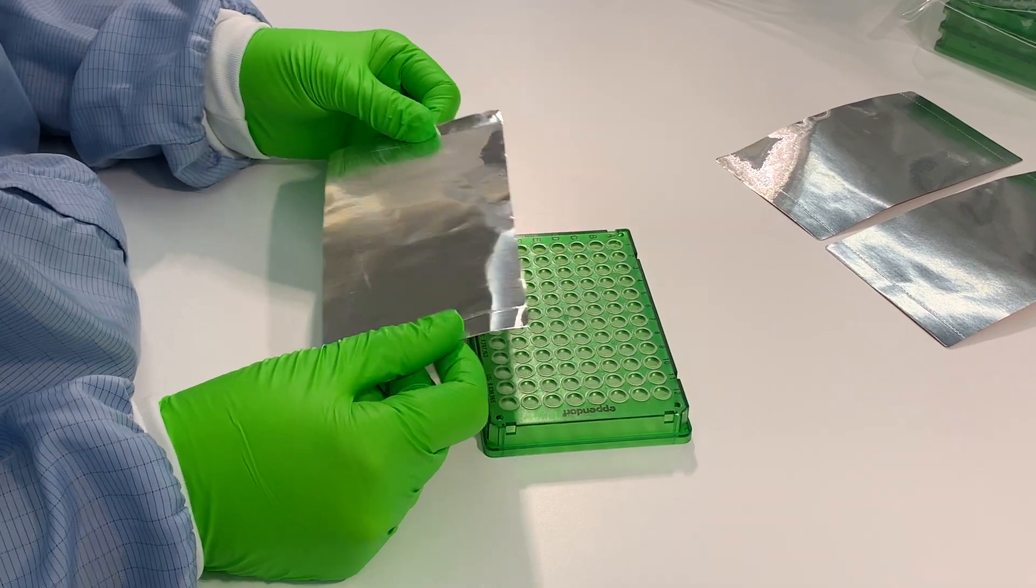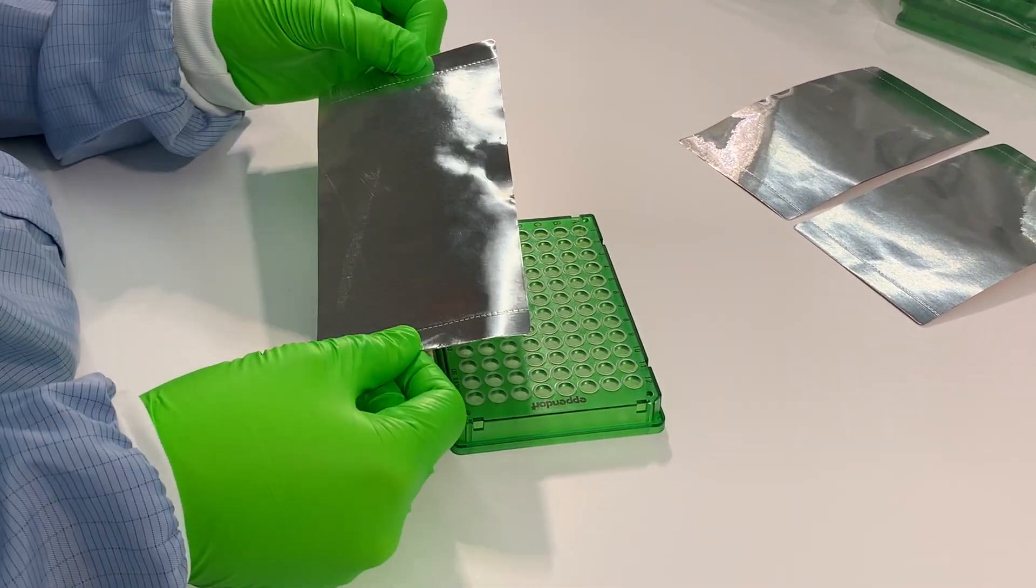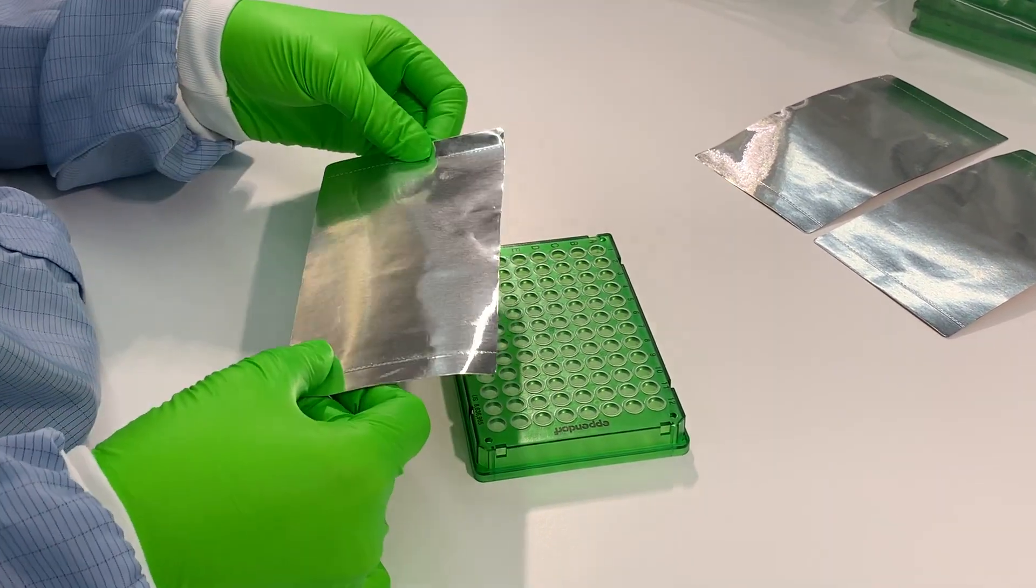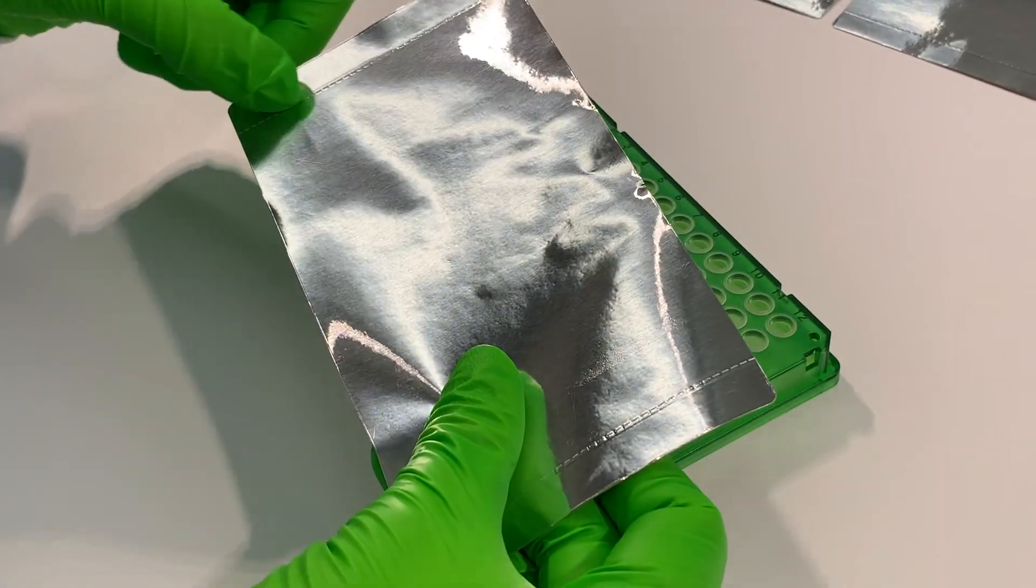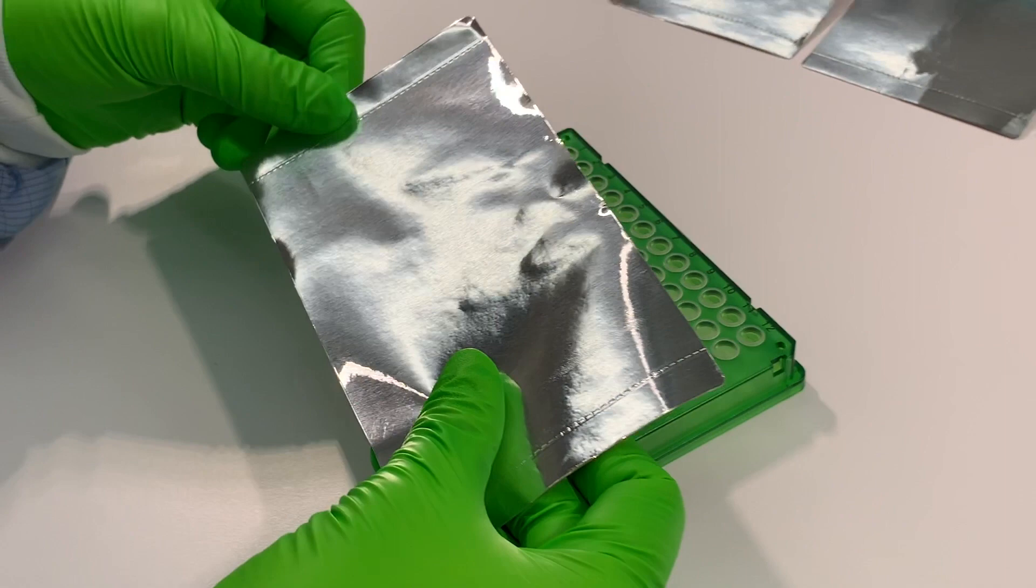The aluminum seals you get together with your plates are covered in the back with a brown protective paper. On either side of the seal, there is a perforation which will help to remove the protective paper and will leave non-sticky wings once the plate is sealed.